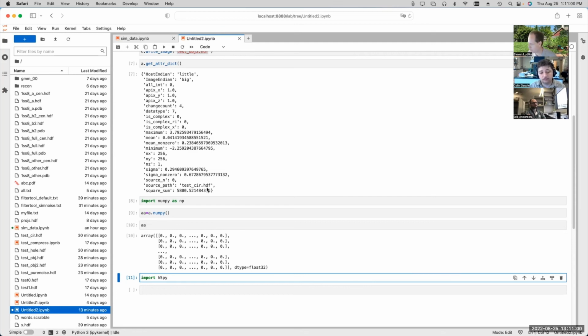I mean, now we're getting very different sorts of movies than the community used to get. Right now the frame rates that you can get out of the cameras can effectively go up to 100 frames per second or 150 frames per second or something like that. The current motion correction algorithms will handle that by just averaging it down to 20 frames a second before it tries to do anything, right? So there's probably room for some additional improvement still in that area, but it's an area of research in itself.